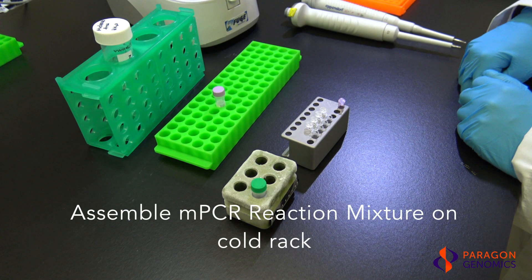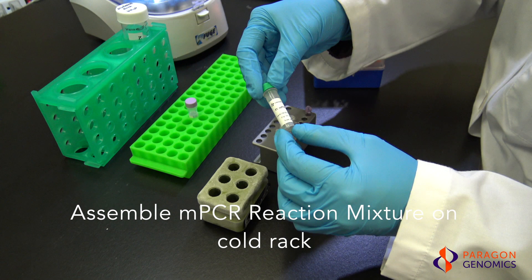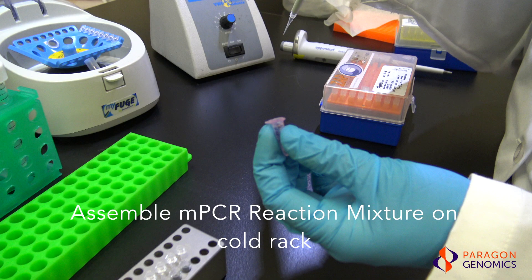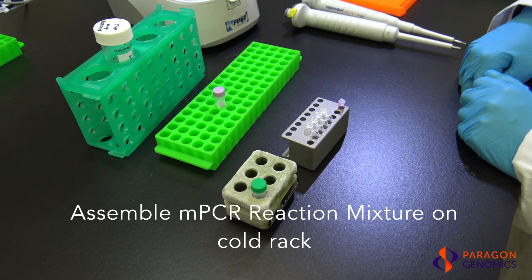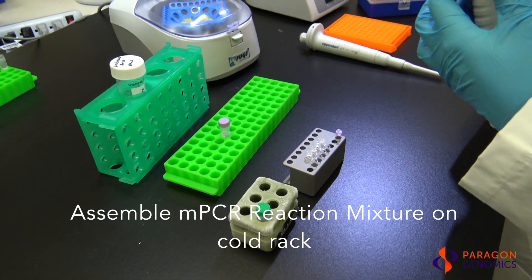To assemble the multiplex PCR reaction mixture, combine nuclease-free water, multiplex PCR mix, multiplex PCR primers, and DNA samples on ice or cold rack. When working with multiple samples, a master mix without DNA samples can be first made to minimize pipetting and cross-contamination.